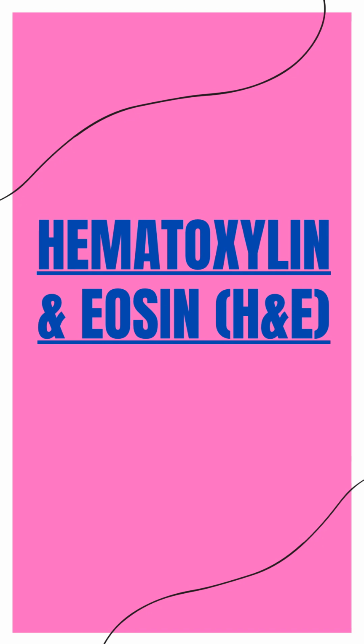Hematoxylin and eosin, H&E, staining. H&E staining is a commonly used technique in pathology to visualize and differentiate various cellular components in tissue sections. This technique involves two main components, hematoxylin and eosin. Hematoxylin, derived from the heartwood of logwood trees, acts as a basic dye and selectively binds to acidic components in the tissue such as cell nuclei.